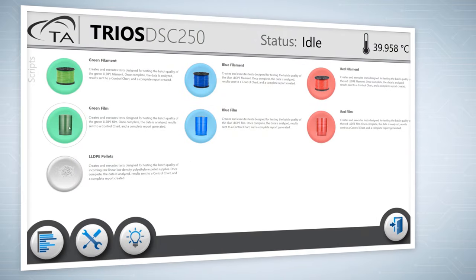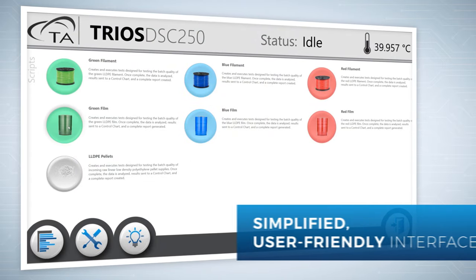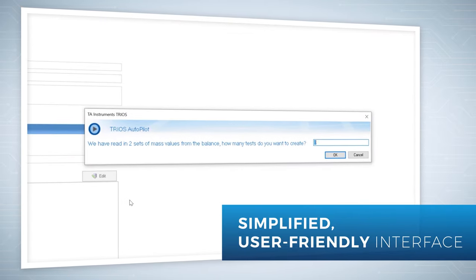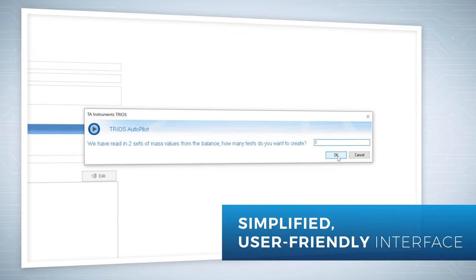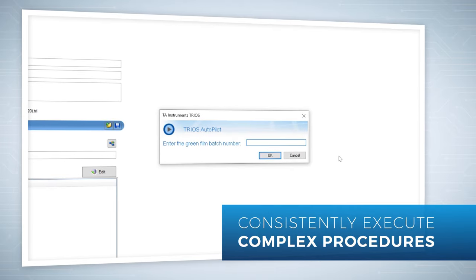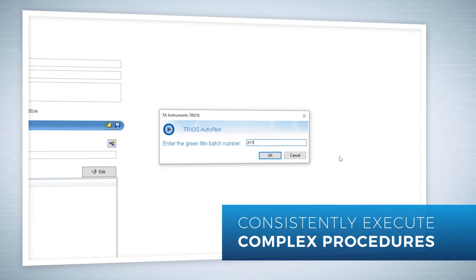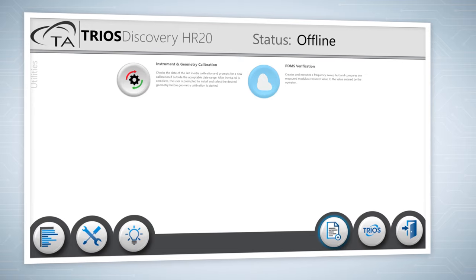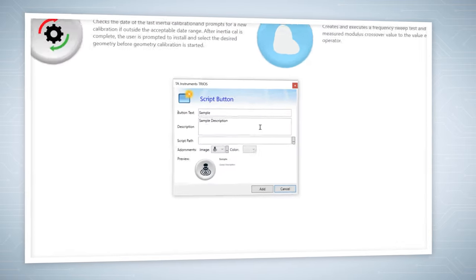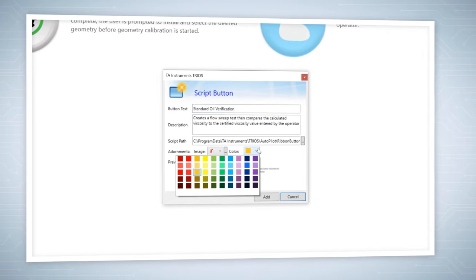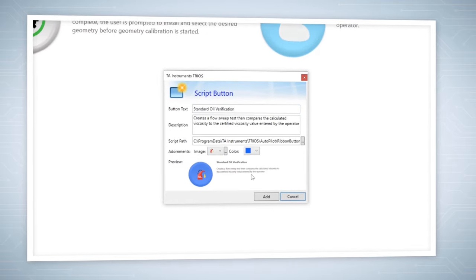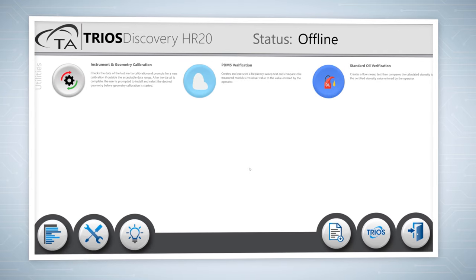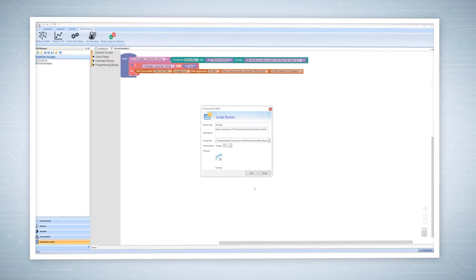Autopilot includes OneTouch, a simplified user-friendly interface. With one click, operators can consistently execute complex procedures. OneTouch simplifies the user's interaction with Trios by allowing them to run scripts through descriptive button icons, ideal for QC environments.